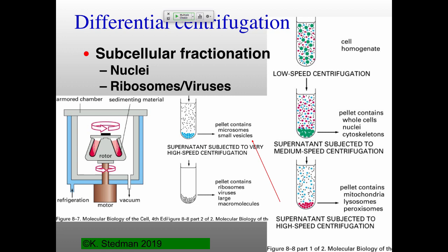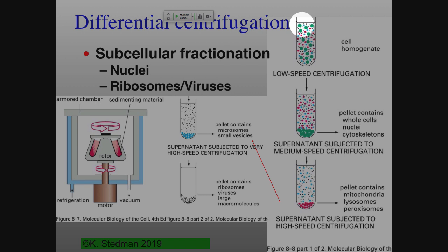We'll be talking about the DNA. Also, you can use these kinds of centrifugation processes to separate the most important things on our planet, which, of course, are these guys right here. But ribosomes and anything that's inside a cell, you want to be able to separate it from other things. Centrifugation is almost always the very first step that you do. And one thing it does is actually concentrates all of the things that you're looking for as well.